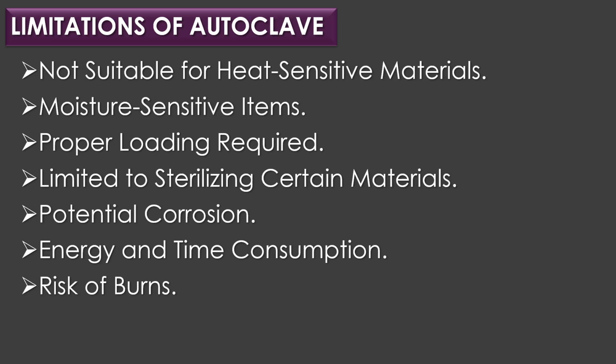Limitations of autoclave. The limitations of autoclave include not suitable for heat sensitive materials, moisture sensitive items, proper loading required, limited to sterilizing certain materials, potential corrosion, energy and time consumption, risk of burns.